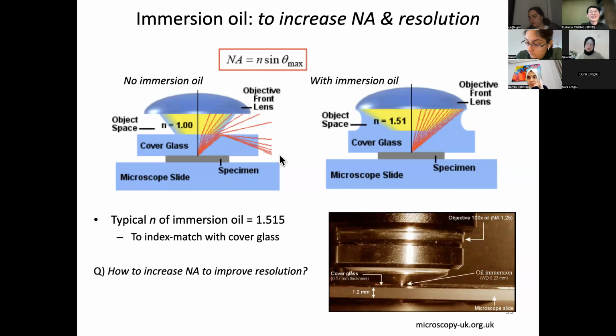Here is a picture of reality. In fact, this is so tiny that the working distance, from the tip of the objective lens to the cover glass, is in this case 230 microns. So you should not approach and break the expensive objective.